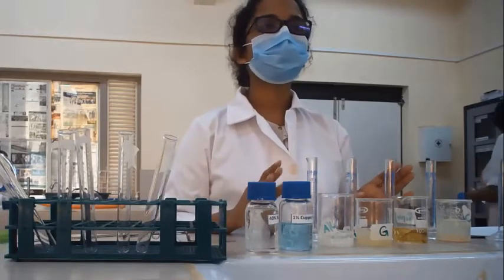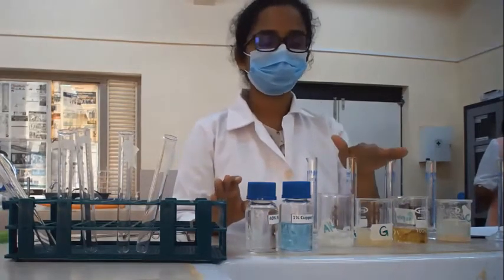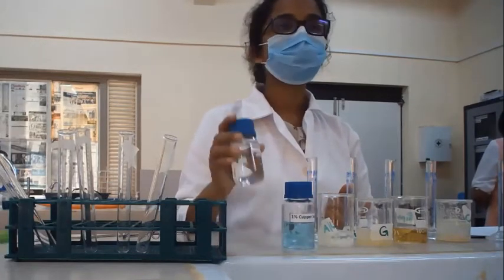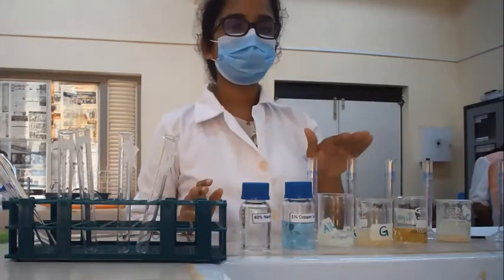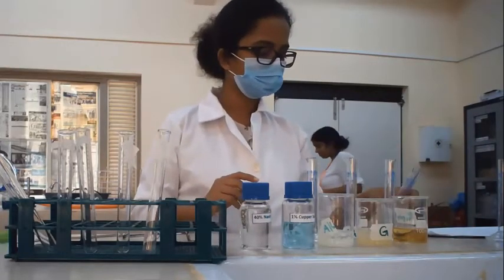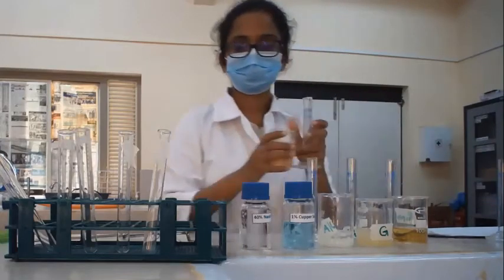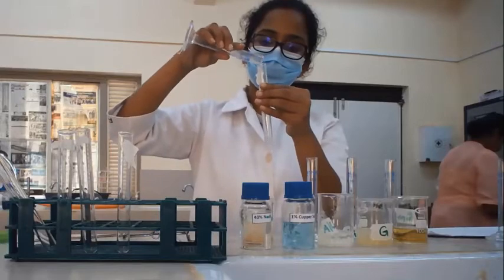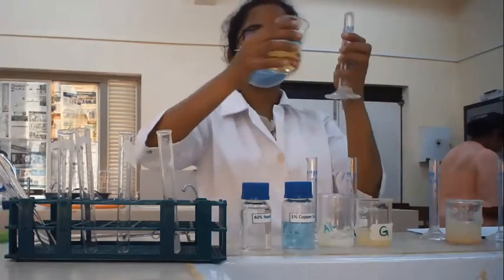For protein, that is the biuret test. For that, we require the prepared test solutions again, and in addition, we are using 1% copper sulfate and sodium hydroxide. First, I'm going to measure 3 milliliters from each of the test solutions into a test tube. Then 3 milliliters from the peptone.